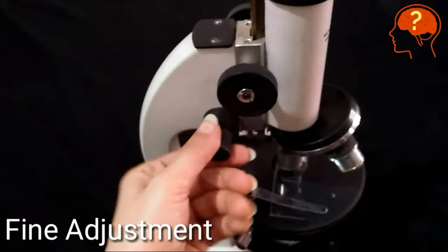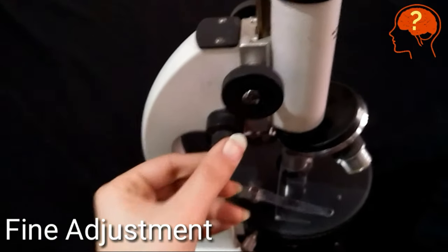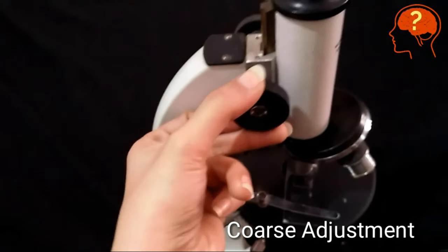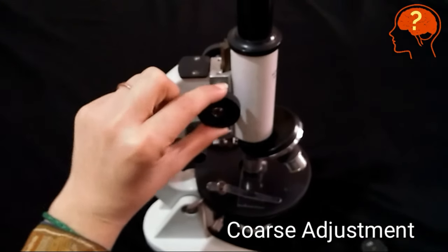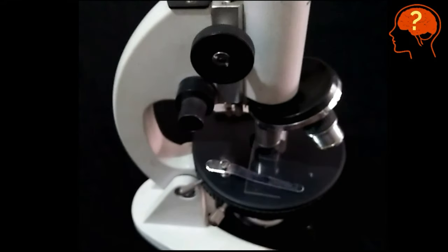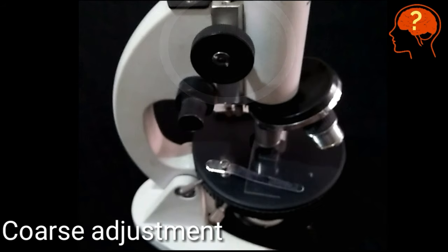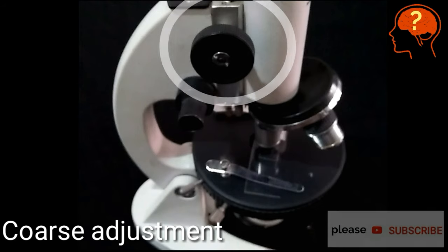This structure is called fine adjustment or fine focus, while this structure is called coarse adjustment or coarse focus. You can focus the specimen by rotating the coarse adjustment according to your eyesight.